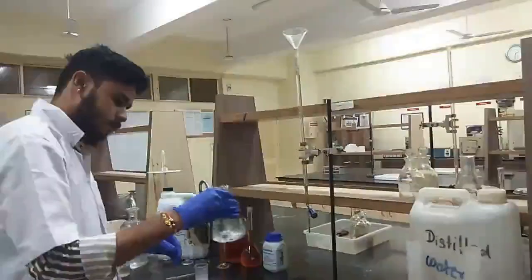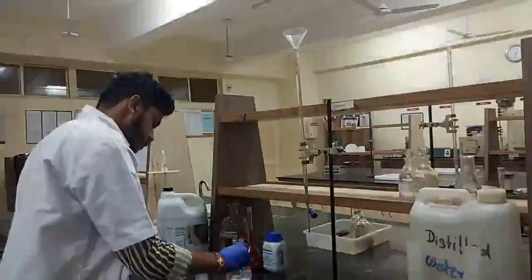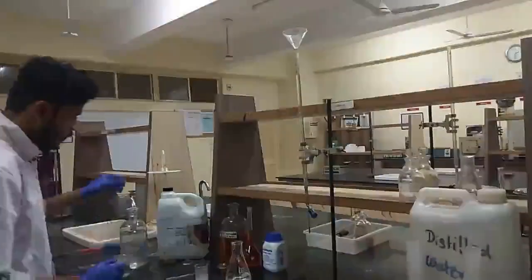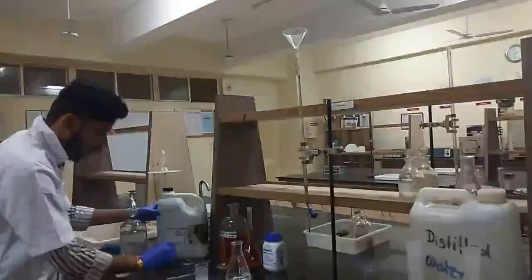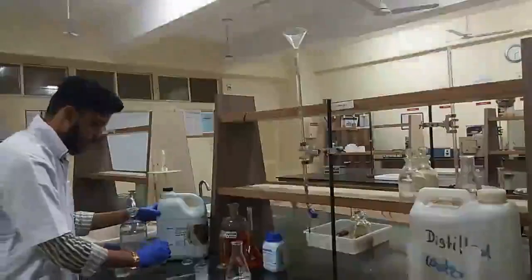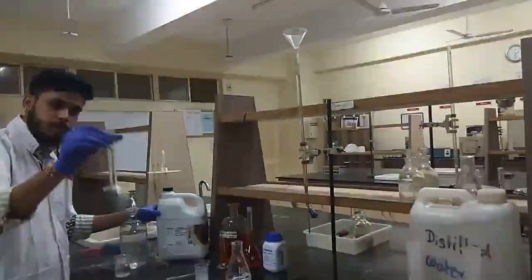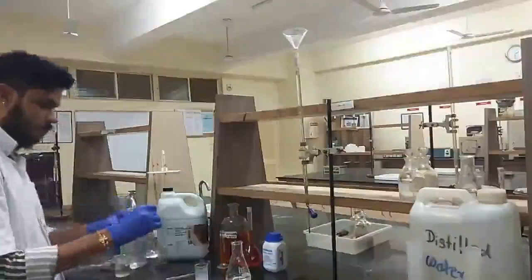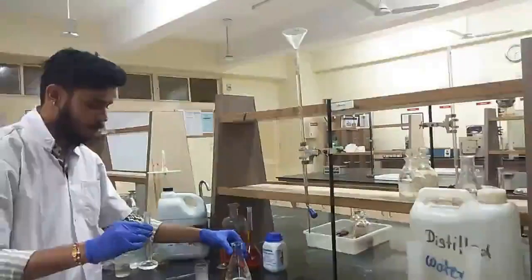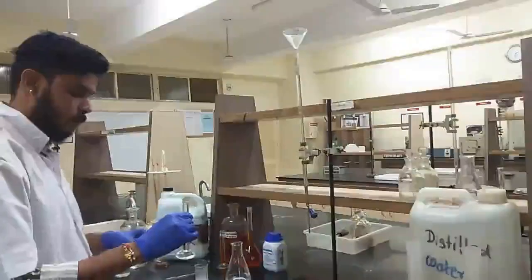Right? After dissolving of all KI crystals, we are going to add 10 ml of 10% dilute H2SO4. So what normally we have in our lab is the 100% H2SO4, which is of 36 normal. So what we require in this case is the 10% of 10 ml dilute H2SO4. So what we will be doing is we will be taking the 10 ml measuring cylinder, and adding 1 ml of H2SO4 in it, and the rest 9 ml of distilled water.